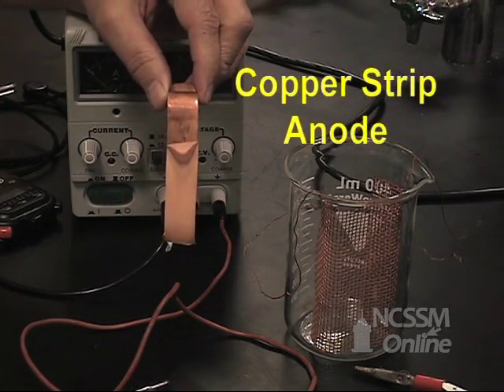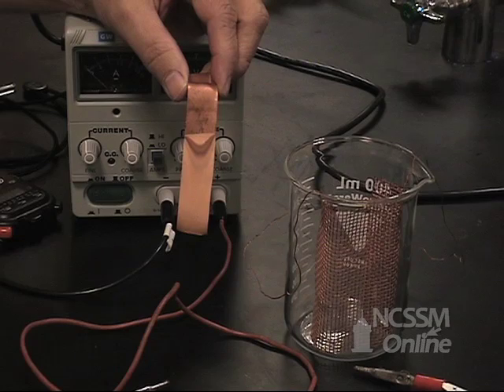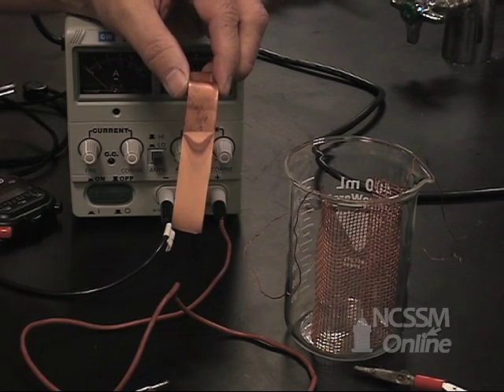We're going to have a copper strip as our anode. We're going to oxidize copper in the anode, and the copper ions are going to go into solution.